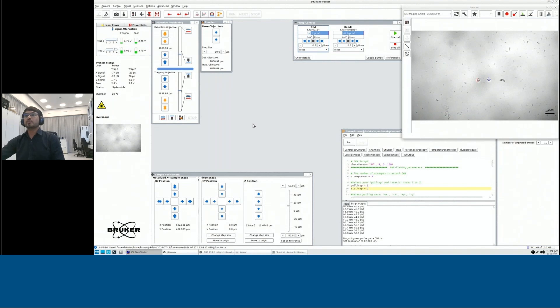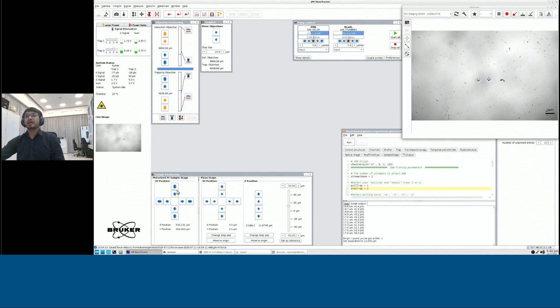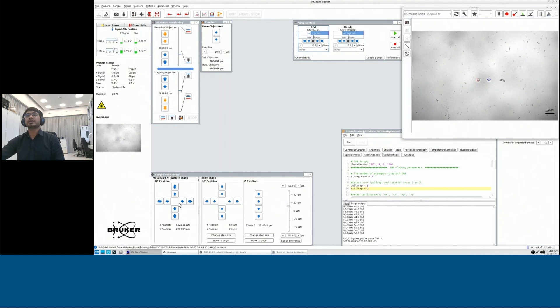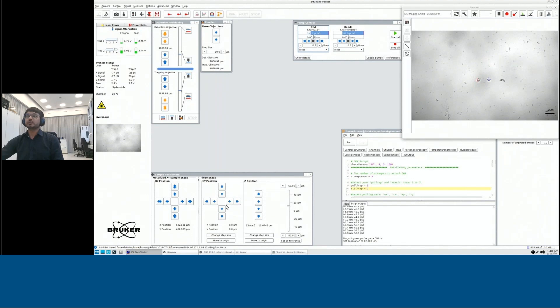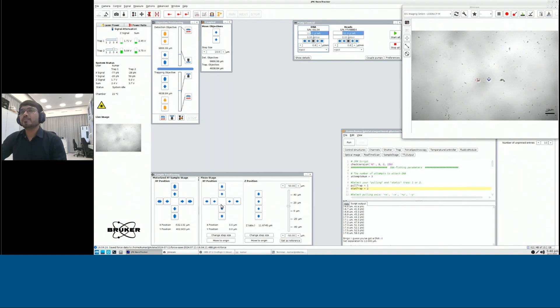Moreover, we also have motorized sample stages. You could see it here, which you could move for a couple of centimeters. But if you want to have a very precise movement of your samples, we also support some nano positioning sample stages, which you could use to move in all three directions XYZ up to 100 micrometers.